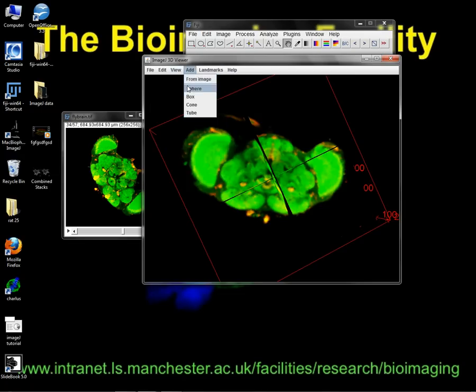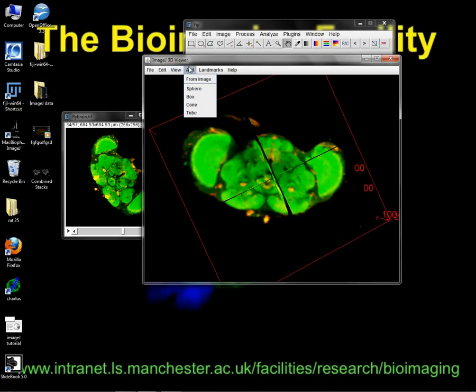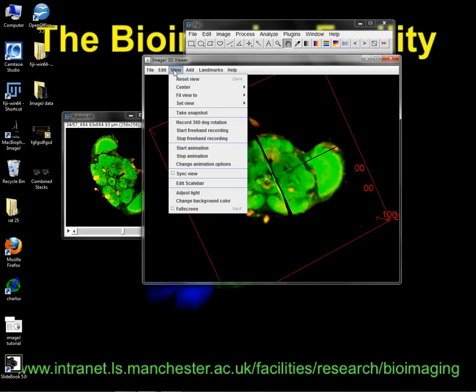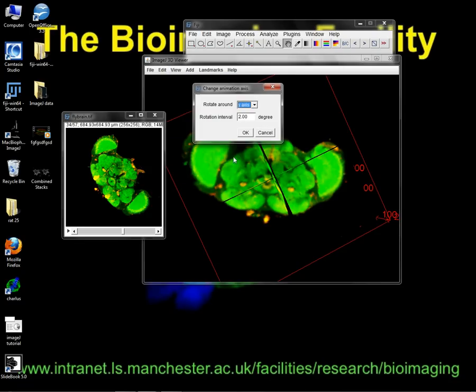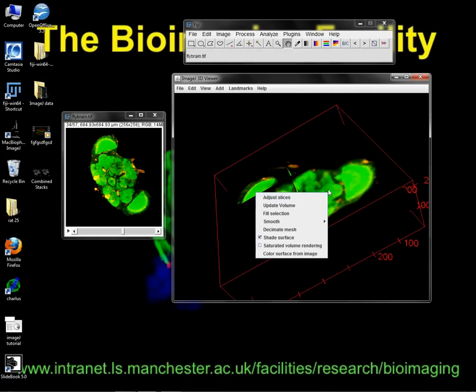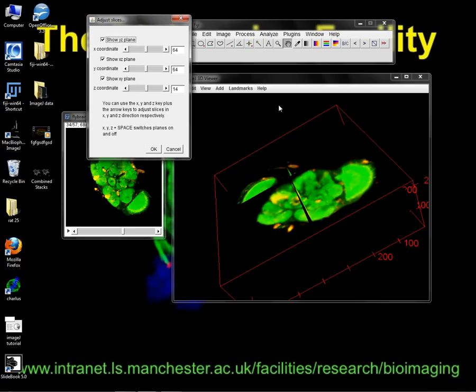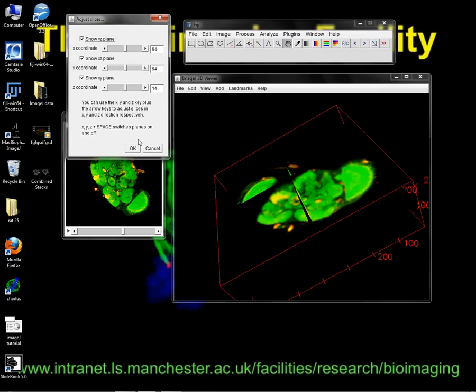If you want to do any of that, if you look around, eventually you will see the options. I just can't see that. Fit to set view. Nah. Okay, it is there. So you can play through the different Zs. Aha! Right click. I'm a Mac user. What on earth is there a right button for? I have no idea. But if you right click when you're on the image, there they are.